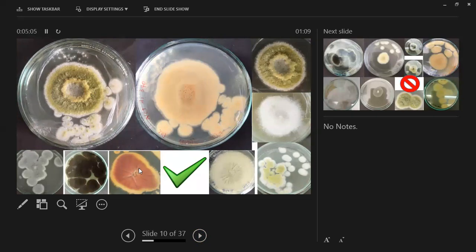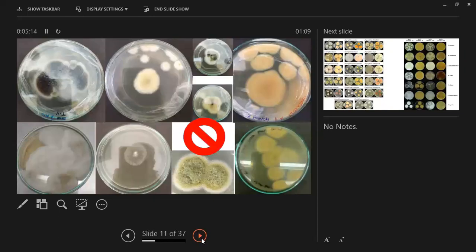Okay? Pictures should be this clear and this clean. So when you compare your picture with the software available for identifying the fungi, molds, and other manuals, your picture should be very clear. You should not take a picture like this, where the camera is visible, the reflections and everything is there, because this renders your actual macromorphology unclear.